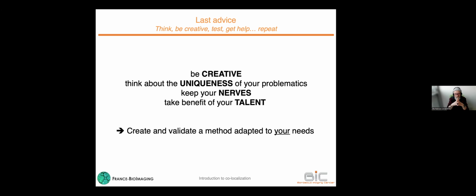There are no big rules, no big dogma in colocalization. Even though people are working with Pearson and Manders, these are only tools, and tools are made to evolve. They are made to ease the process, but if it's not easing your process, just go ahead and invent your own tool. This is the message that I want to share with you.